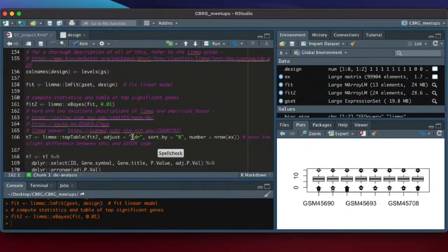We have to do some kind of multiple comparison adjustment. The default is FDR, which is Benjamini-Hochberg, and that's what the FDR corresponds to. But there are others available. There's this B statistic, and that actually corresponds to this proportion value here. It's the log odds of seeing differential expression. So if B is equal to 0, that means there's a 50-50 chance of seeing differential expression. I'm a little confused by this, but basically, if you don't have any missing values in your data set, the way that topTable ranks your genes will be identical whether you use this B statistic or the p-values.